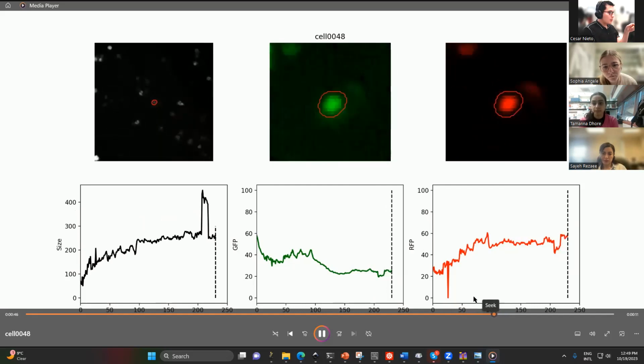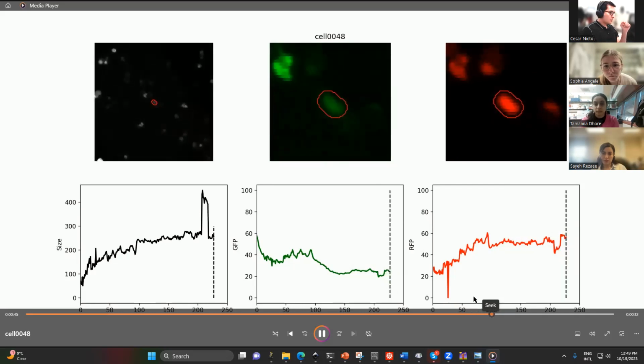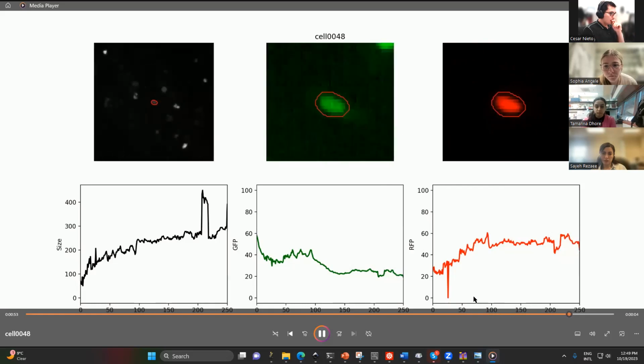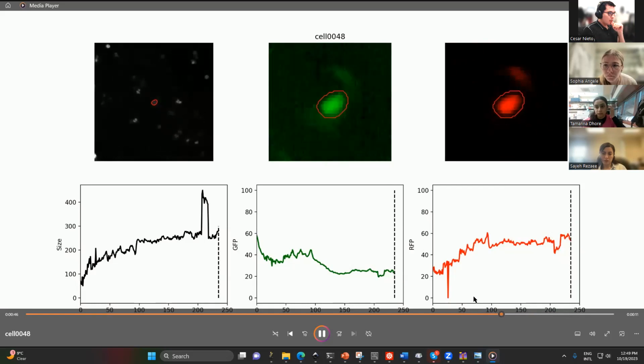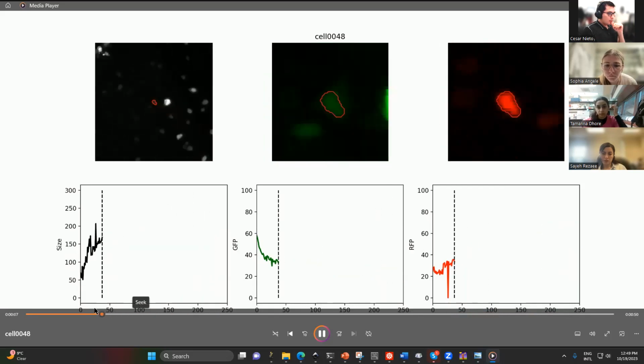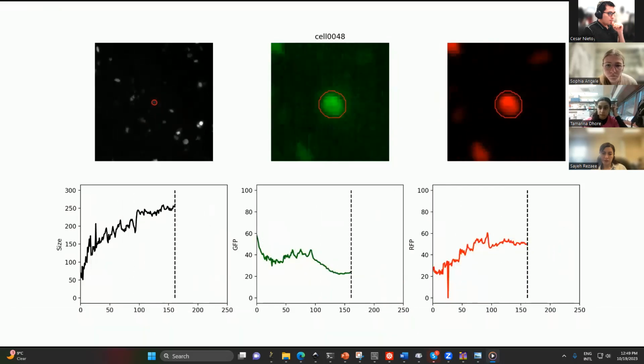So maybe this can be confusing for you, but I should check how to fix this problem. The same with the red.